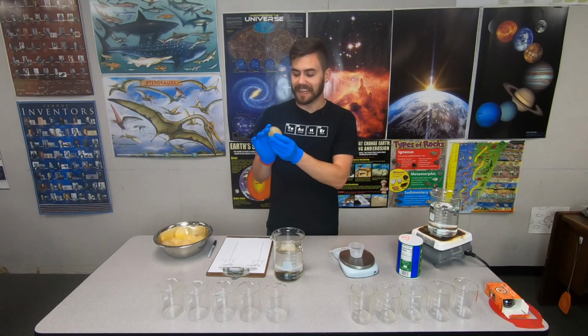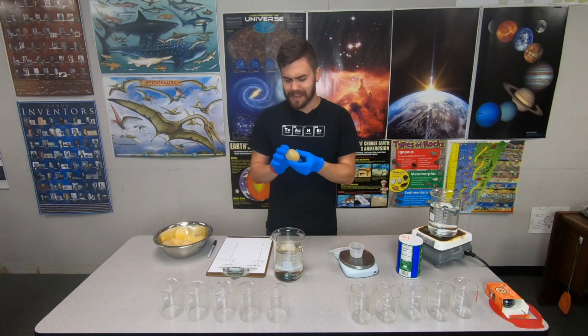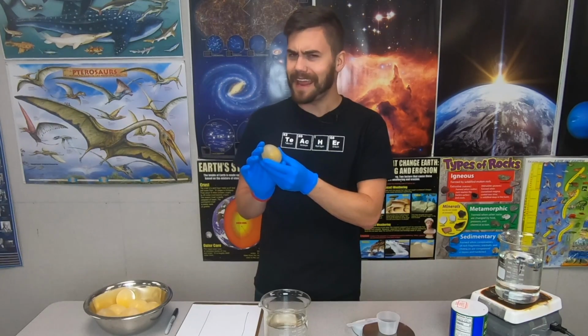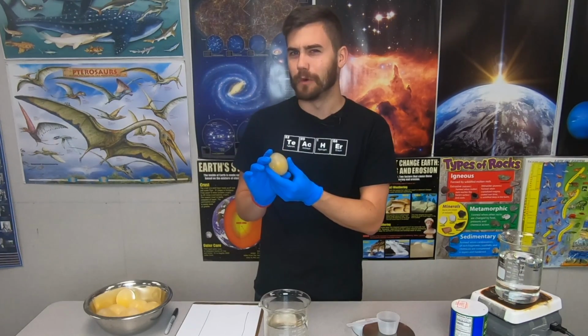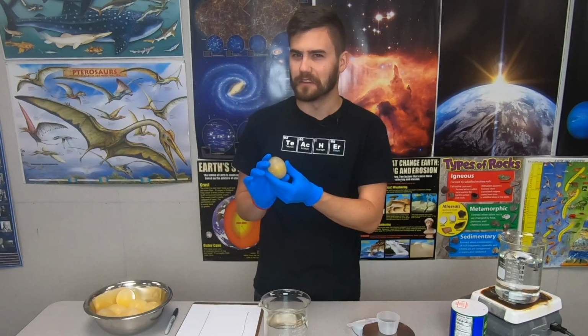The acetic acid in the vinegar chemically reacts with the calcium carbonate shell and totally dissolves it. And all we're left with is the skin, the very thin membrane that surrounds the chicken eggs. This is going to serve as our model cell. Well, actually, an egg is a cell. This chicken egg technically is one cell, which makes an ostrich egg technically one cell also.